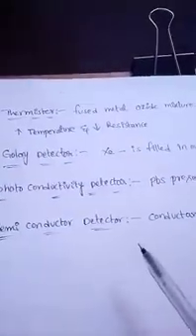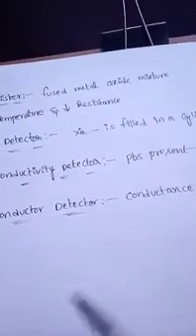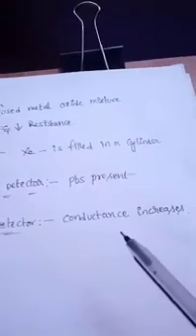These are the detector materials. We already know the amplifier and recorder purpose from UV spectroscopy. This is the instrumentation of IR spectroscopy. Is it clear, students?